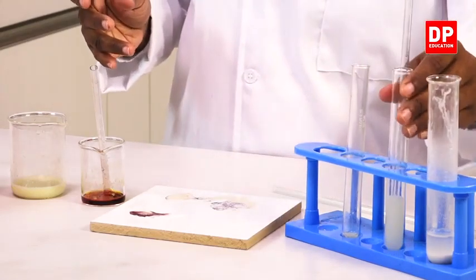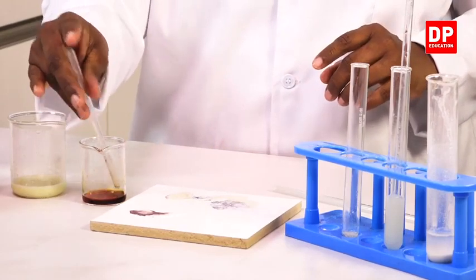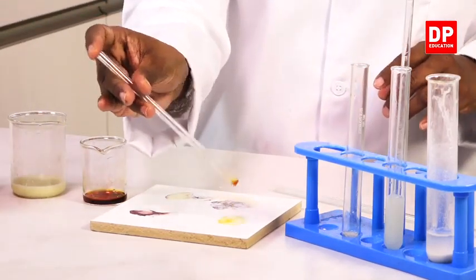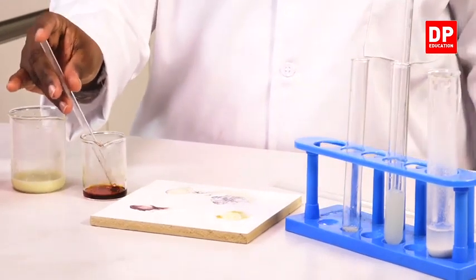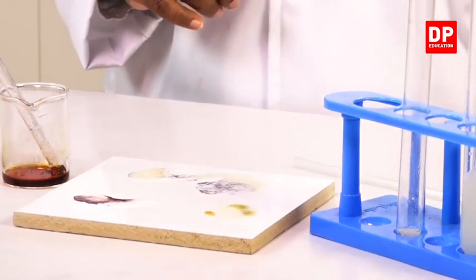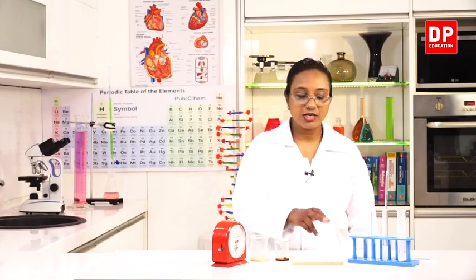This is again a mixture of starch and amylase that has been reacting for 20 minutes. To that, we'll add a drop of iodine. You can clearly see that it gives a reddish brown color. So from this observation you can conclude that there is no starch in this reaction mixture.